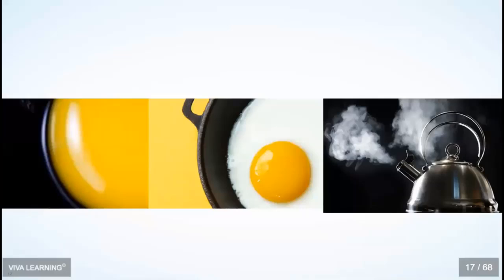What we want is that evaporated steam, or the vapor, and that's where that empty space is between the opening of the spout and the very beginning of the billowy cloud. That blank spot isn't blank. That's where the saturated steam is, the most efficient vapor that's going to transmit heat. That's the moist heat that we want to work with.